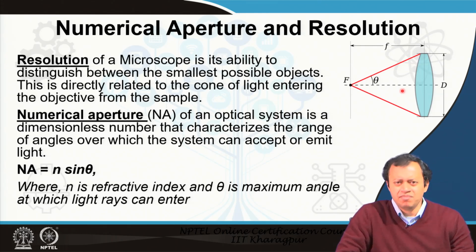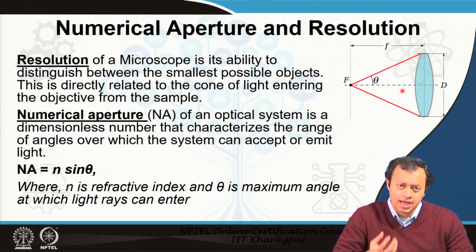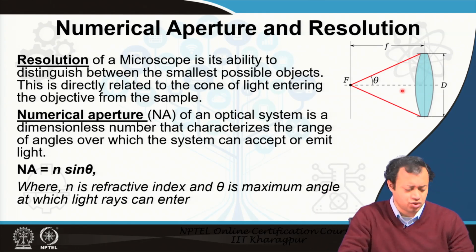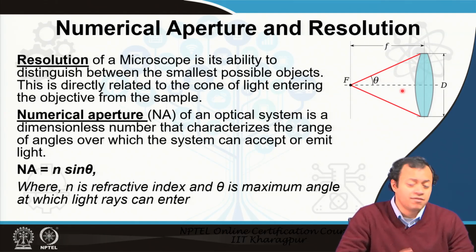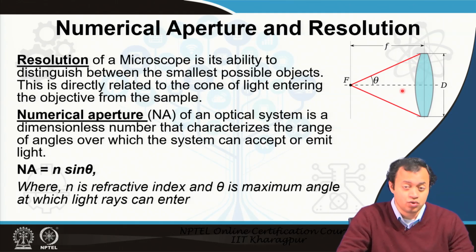So, these are the very basics of microscopy. If you are interested in any type of microscopy, not just optical microscopy, such as scanning electron microscopy, transmission electron microscopy, atomic force microscopy, or ion beam microscopy, there are different types. I'll just go through some simple microscopic techniques. Here I am going to focus on how photonics technologies have revolutionized microscopy. But if you are interested in other non-optical microscopies like electron microscopy, there are several beautiful courses going on, some of them given by my own colleagues here at IIT Kharagpur. Please go through them, they are fascinating.